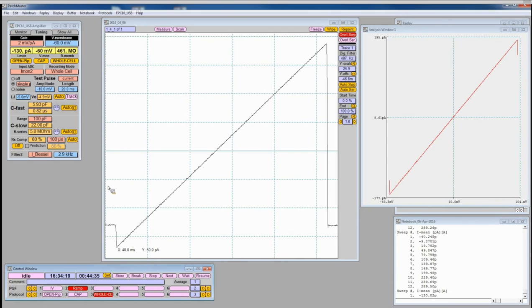I want to quickly show you that little changes in settings can have effects on your display and on basically cosmetics that I'm showing you now. For example, the program wants to make sure that it gets the whole ramp. So a couple of recording points before the ramp starts, the program already gets started, as well as at the end. Yeah. So to get rid of these kind of not so nice looking beginning and end, you can change things in the step protocol itself.